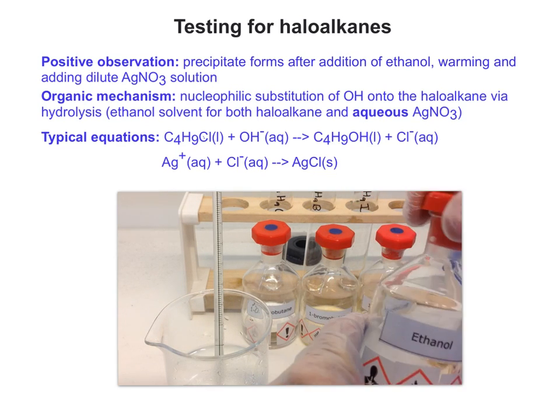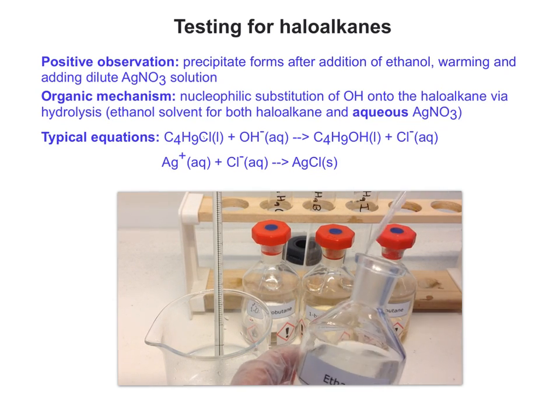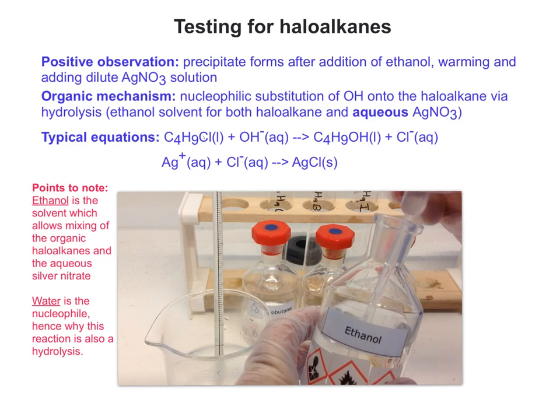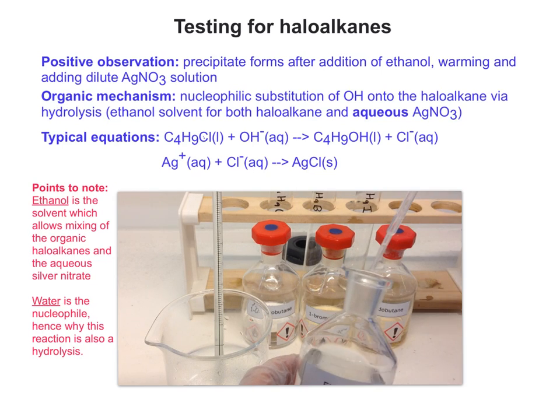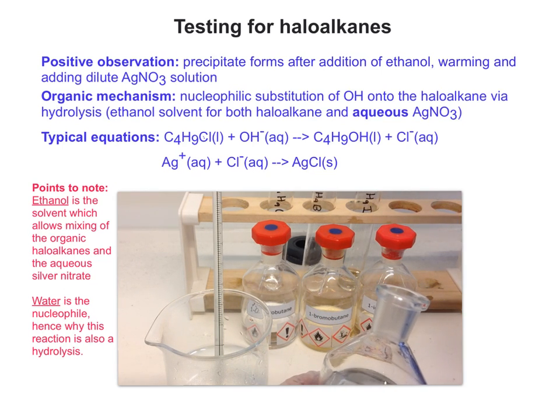So now we add some ethanol. And the ethanol has the role of a solvent. So remembering that haloalkanes are insoluble in water, what we need is something that can allow the haloalkane and the aqueous solution to mix, because the water is what's actually behaving as a nucleophile.